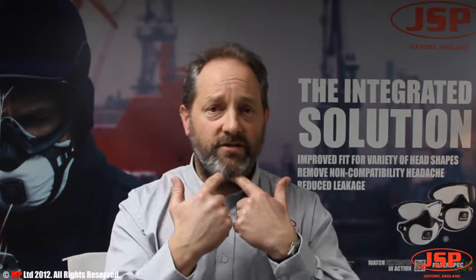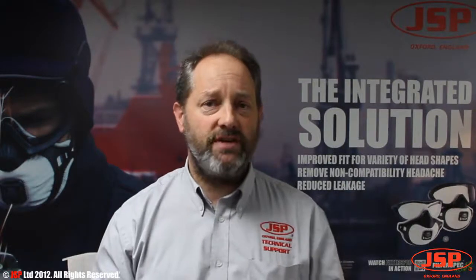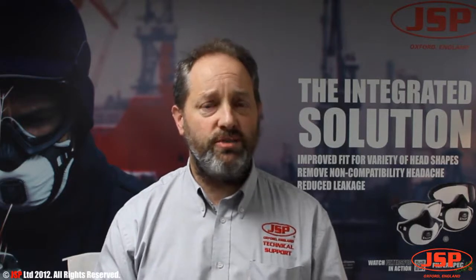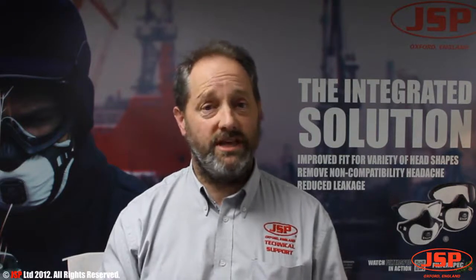What are we looking to do? You're looking to make sure that you get a good fit around the face. Obviously with my face fuzz, that's not going to happen — you've got to be clean shaven to be doing fit testing with a tight fitting respirator. The HSE want you to do this to make sure that all the people working for you are actually getting the levels of protection they expect to get from the product you're giving them.